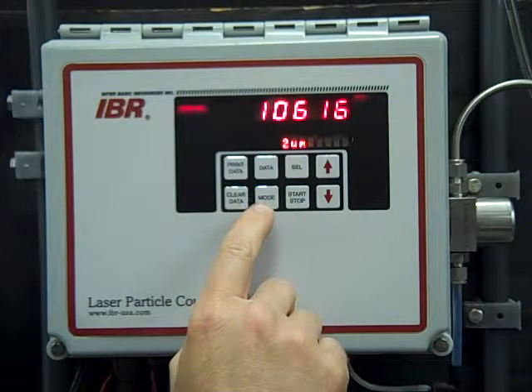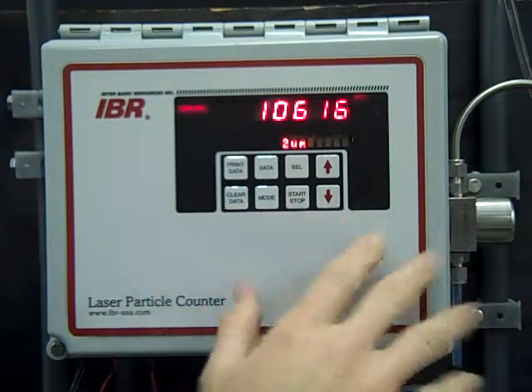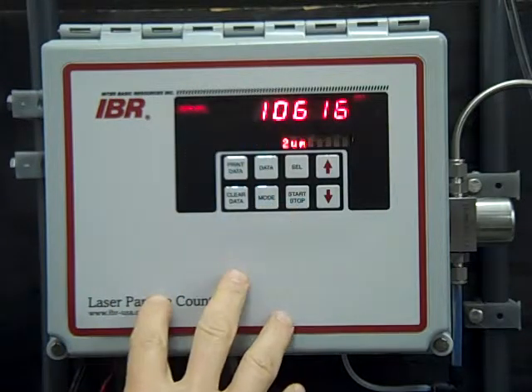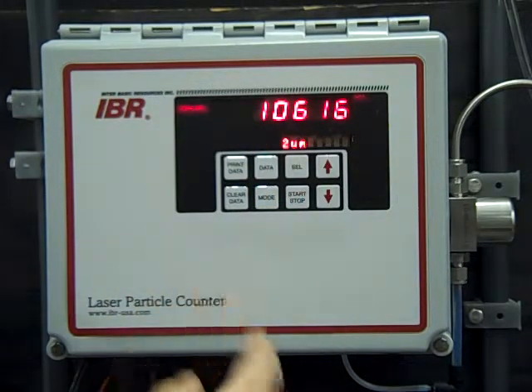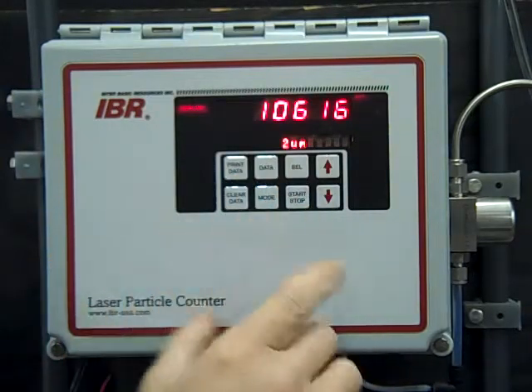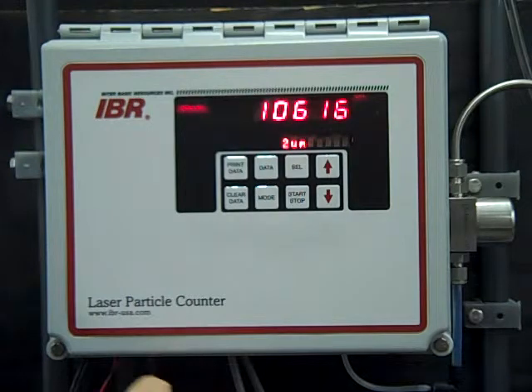So 10-second count is completed. The counter is stopped. Normally, the particle counters don't stop. They continually run. As I said, I set this up for demonstration purposes to stop at 10 seconds.